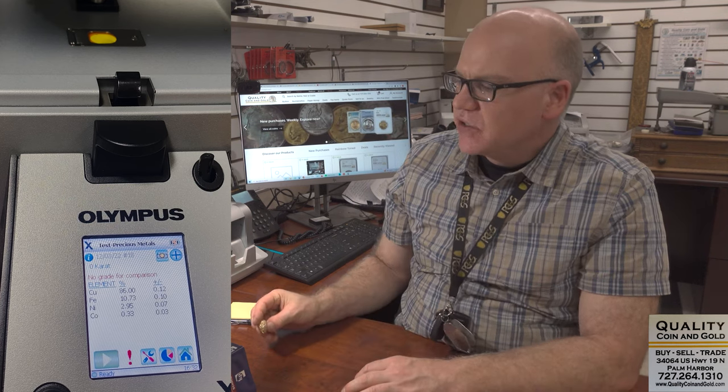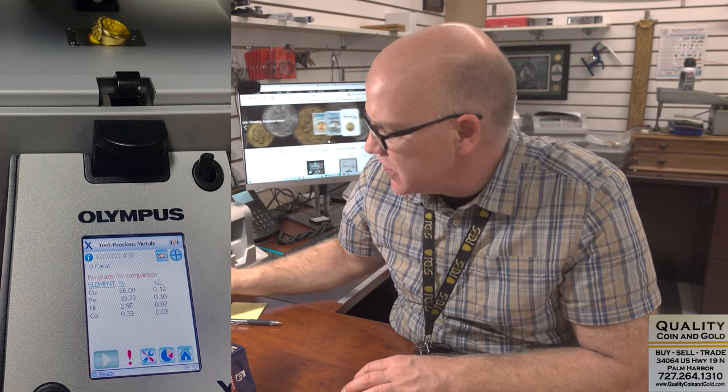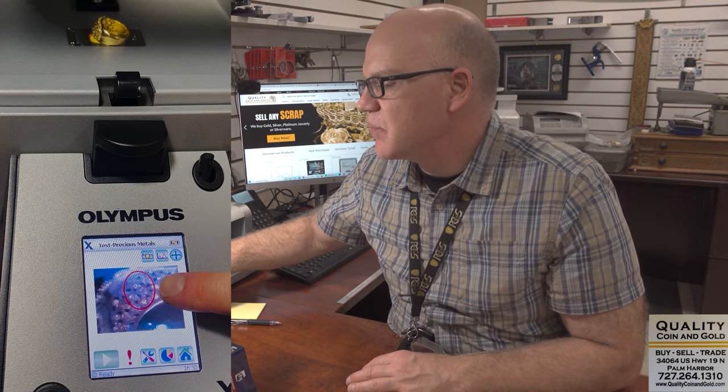The first thing I want to show you is one of the most important tools that we use — this is an XRF x-ray machine that's going to test the outside of the metal and help us verify karat. I'm just going to put the first ring, which is stamped 14K, into the XRF. We're going to look at the camera on the XRF so you can see we're taking a picture of it and taking a nice, strong sample.